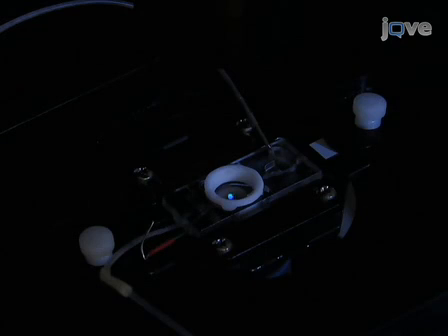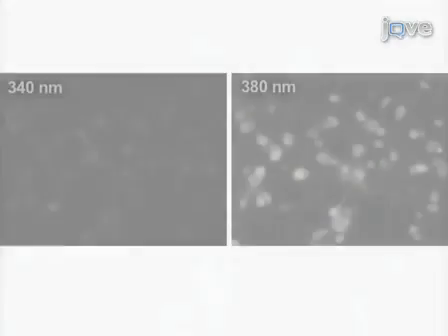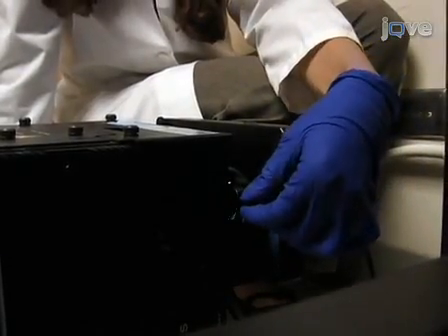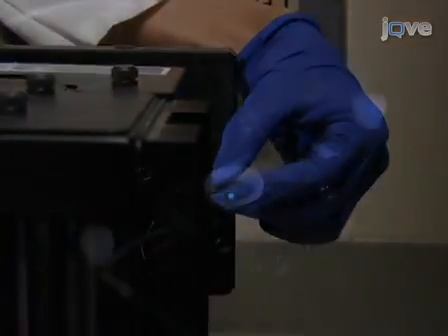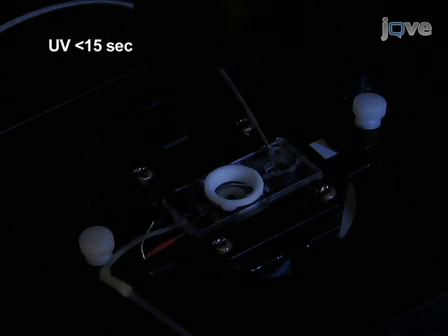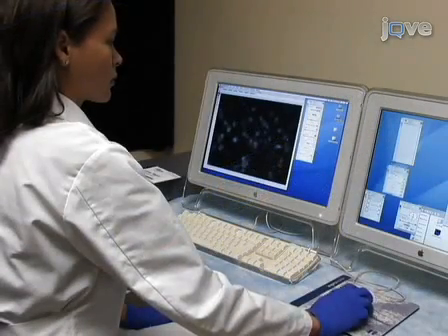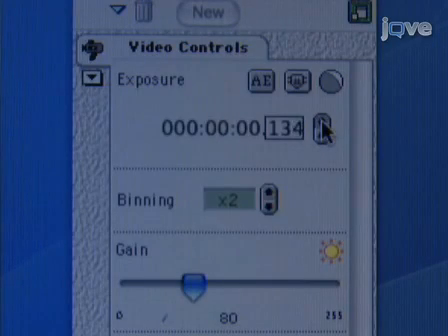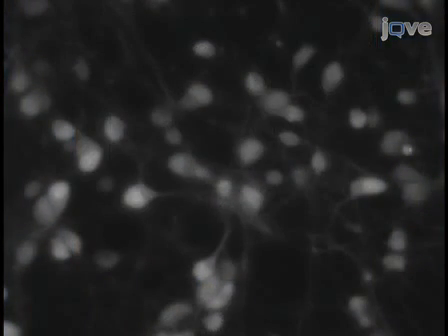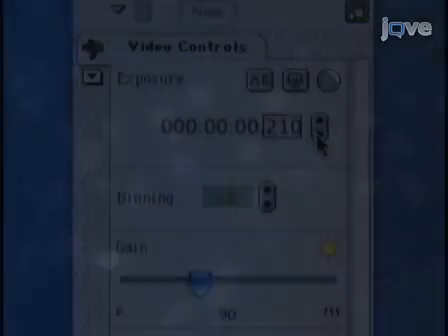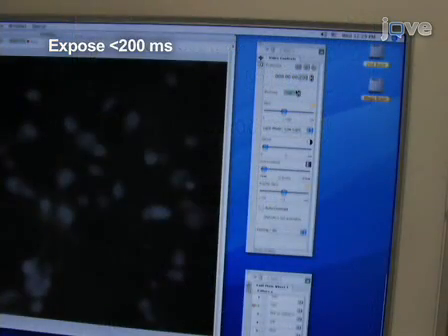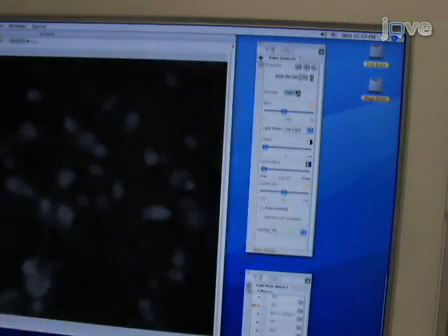After connecting the perfusion lines, focus on the cells using transmitted light. Once the cells are in focus, open the fluorescent shutter and look through the eyepieces to examine the fluorescence of the cells using illumination at 340 and 380 nanometer wavelengths. Resting cells should be dim at 340 and bright at 380. To prevent phototoxicity, the intensity of the excitation light should be reduced with a neutral density filter and cells should not be illuminated with UV light for more than 10 or 15 seconds. Now examine the cells using the camera and set the gain and exposure to generate an image close to saturation at 380 nanometers and well below saturation at 340 nanometers. Keep the exposure time at 200 milliseconds or shorter if possible. Once set, do not change the camera gain or exposure.